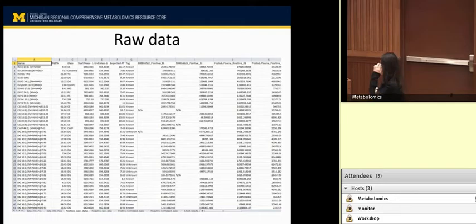We decided to give this known or unknown tag because all the lipids that we give are named, but we see about 10 to 15% of odd chain fatty acid lipids, which is not so usual to see in plasma or even in any tissue samples, except I think bacteria.